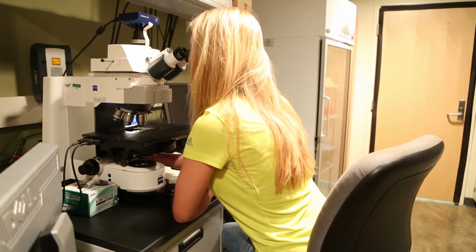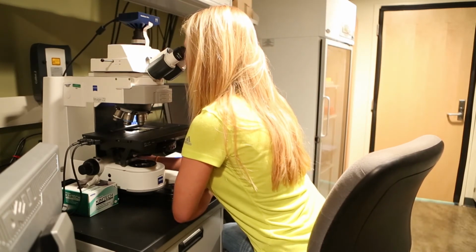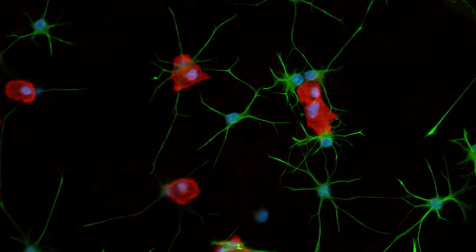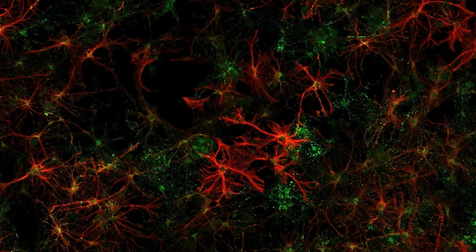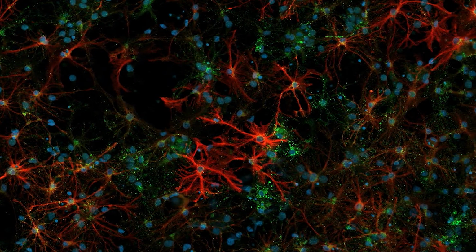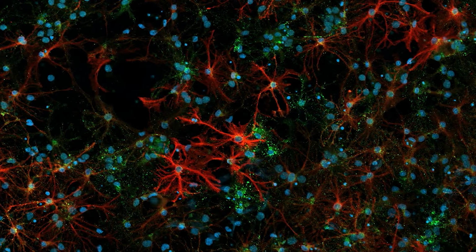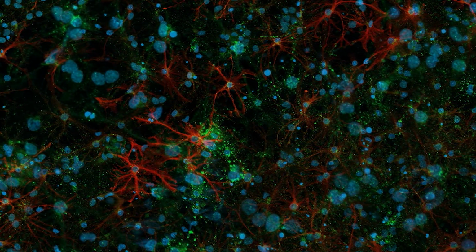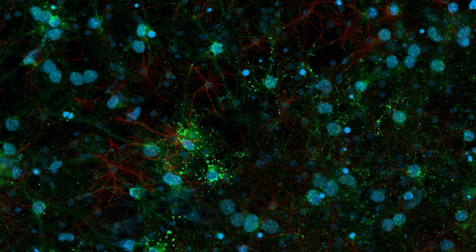So what microscopy does is it allows us to get down to the cell level, and with the one microscope that we have in the lab, we actually can look inside living cells. Most of the time we're fixing the cells so they're dead, and then we're just looking at a static picture. But we also have the capability to look at what's going on inside a living cell.